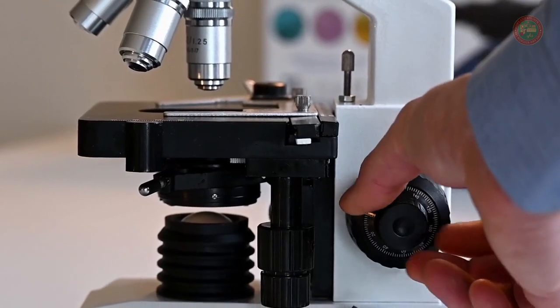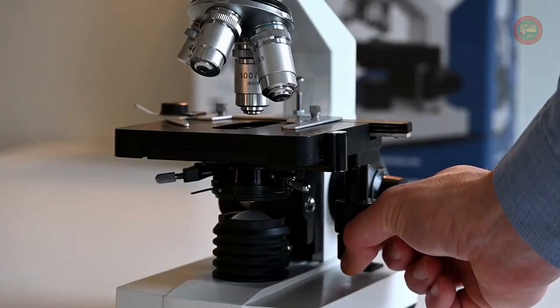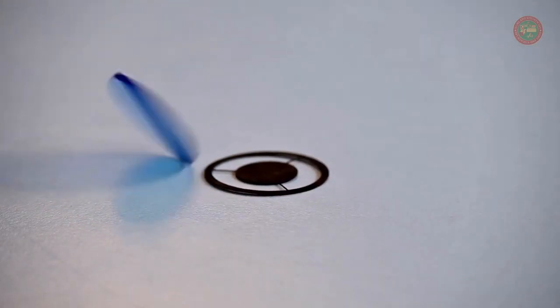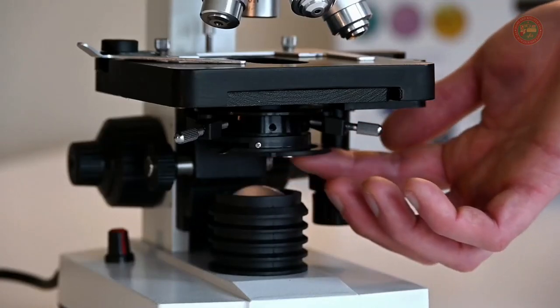Use the coarse and fine focus knobs on either side of the microscope to get a sharp image. You can move your sample around with the stage controls. If you want a different illumination technique, add one of the included filters to the swing-out filter holder underneath the condenser.